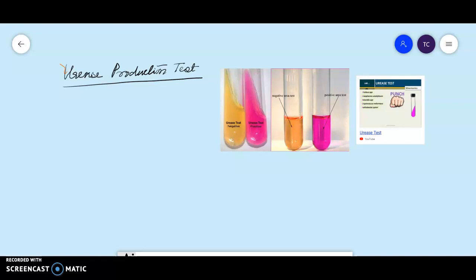So for the urease production test, let's move back to the history of the urease production test. Now you know that this is basically done by the help of your urea agar. Okay?